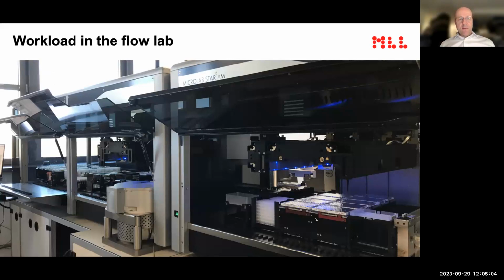I would just like to refer to it because we take a holistic approach and try to automate anything. This is just to give you an impression of the automated pipetting we do. We place the patient samples in here, and, as you see on the next slide, which is a video, the antibodies, which are in dried format, will be brought into solution, and then everything is pipetted like by hand, but it's fully automated with a centrifuge on deck.